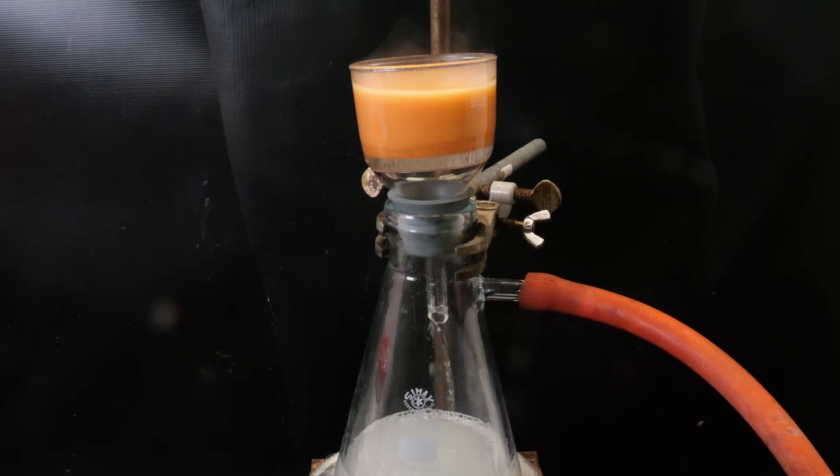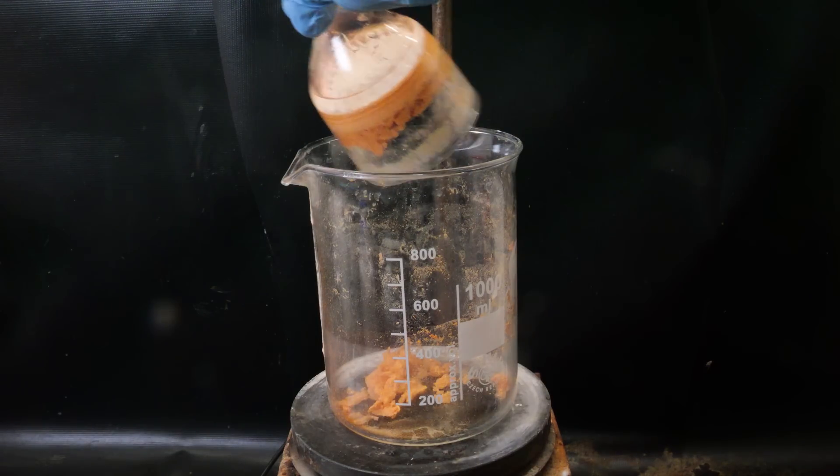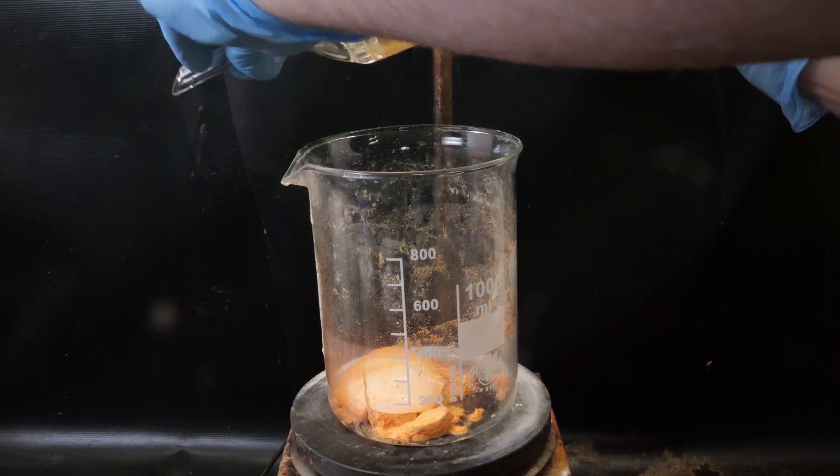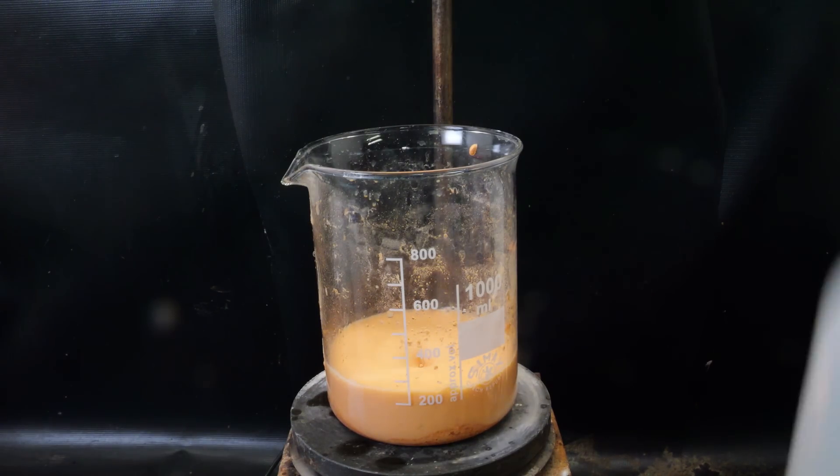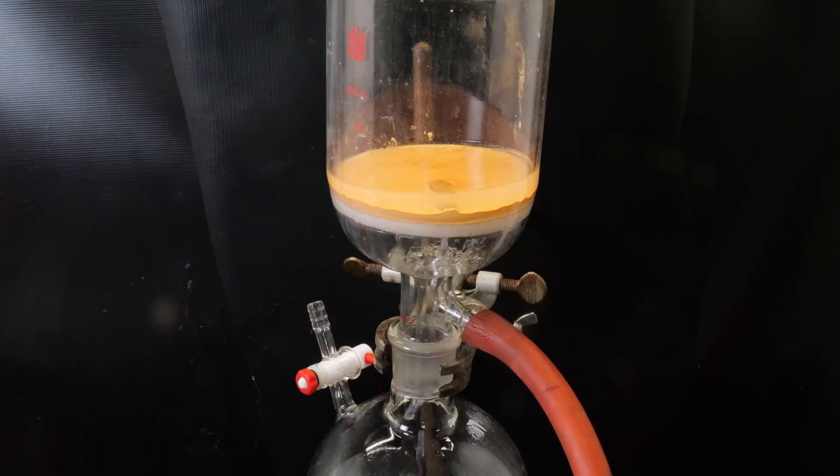I set this up for vacuum filtration to collect all the product. Now it is still contaminated with salts, so I will stir it with some water for a while to clean it up. I then filter it again, wash it with more water, and then with a large amount of acetone.